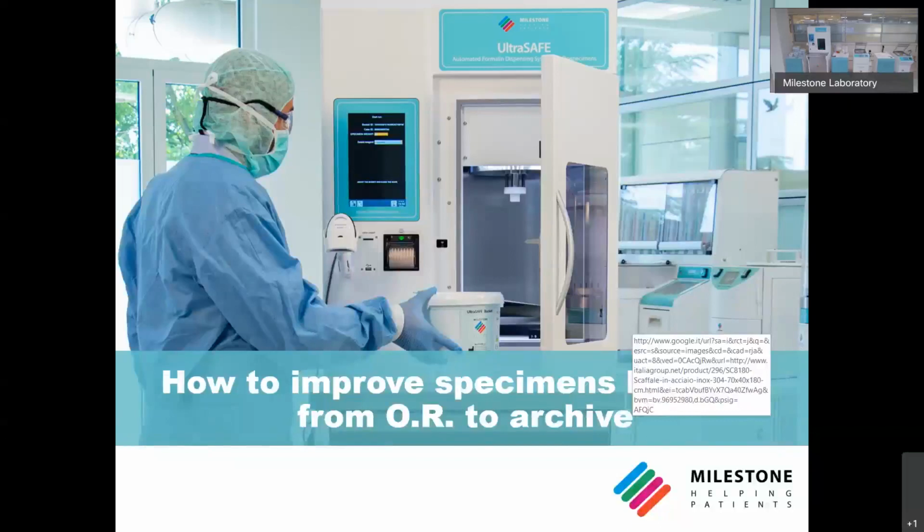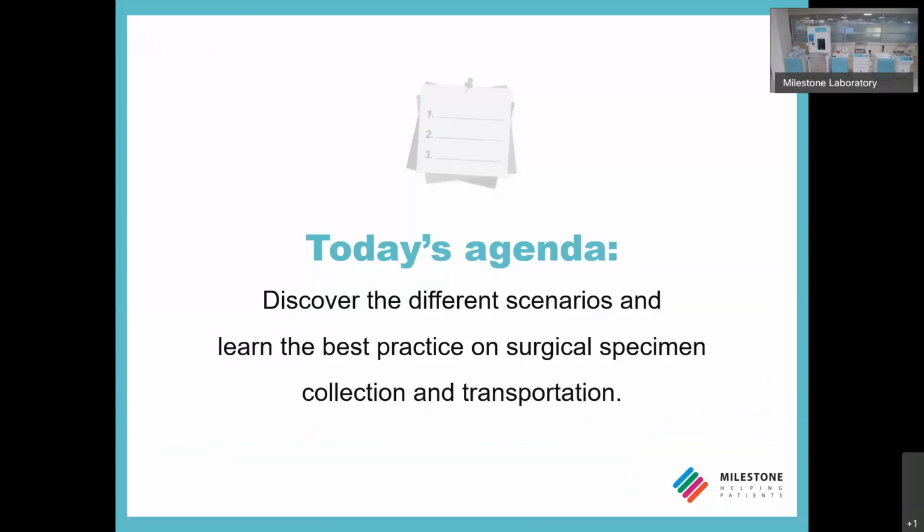Thank you, Michela, and thank you to all the participants to this webinar with the title How to Improve Specimen Handling from Operating Room to the Archive. So let's see together what will be the agenda of today's webinar. We will discover different scenarios and try to learn the best practice on surgical specimen collection and transportation. That will be the aim of today's webinar. Then, as mentioned by Michela, we will have a practical live demonstration from our laboratory at Milestone headquarters.